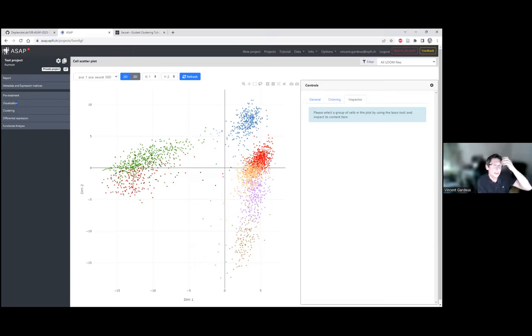We actually collaborated recently with two groups, so a group from UNIL, which is called BG. They're developing another website called BG. And we also collaborate with a group in ETH in Zurich from Mark Robinson's group. And we actually developed already an automated annotation pipeline, but it's still under benchmarking. So we are on the verge of implementing it in ASAP. So that's something that we want to add in the near future to help people to annotate the dataset.